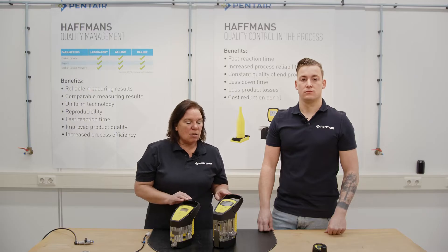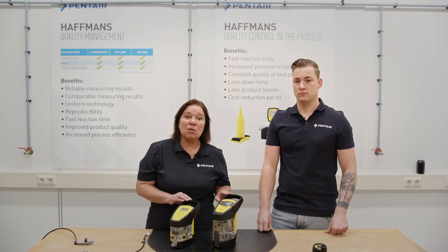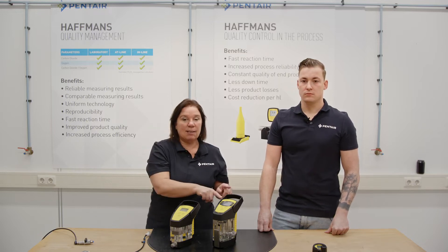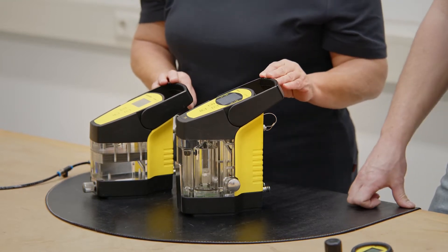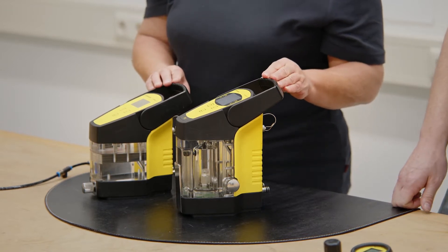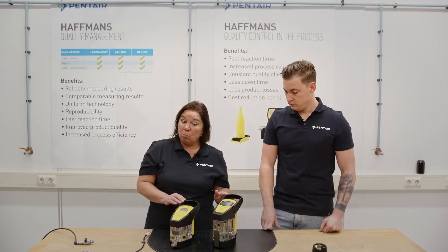The sensors show a slight wear. After one million exposures, a calibration warning will show up as a triangle in the display. It is also advised to control and check once a year the oxygen calibration drift, so we advise to at least check the zero point.